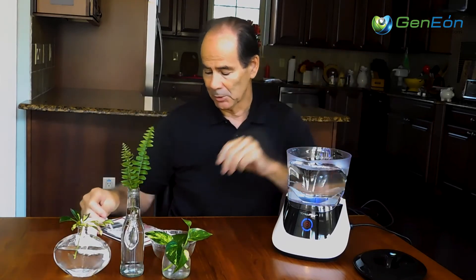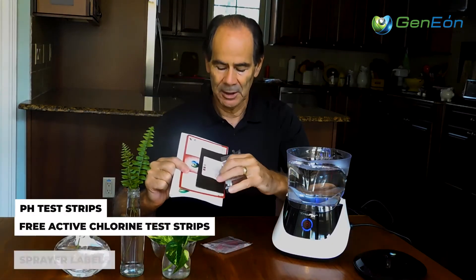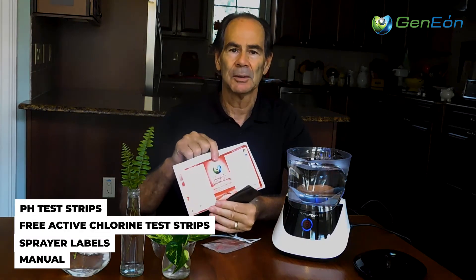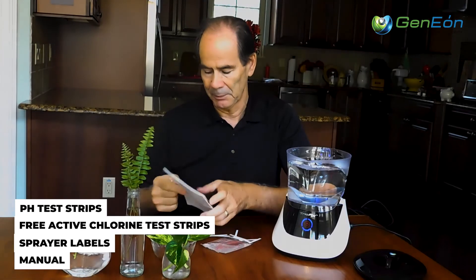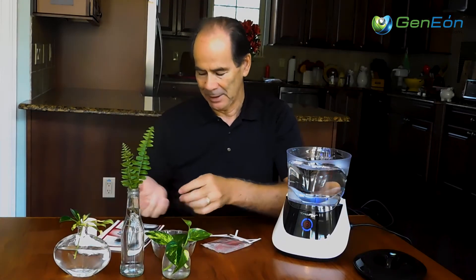Let me take one of our test strips, which are included when we send you this unit. You get test strips on pH, and you get test strips on free hypochlorine — hypochlorous acid. And then you also get labels, and we have plenty more labels if you want them. In addition to that, there's a book, so for you people that like to read a lot, one more thing to read, put on your bedtime reading list.